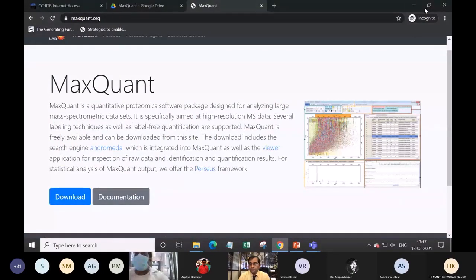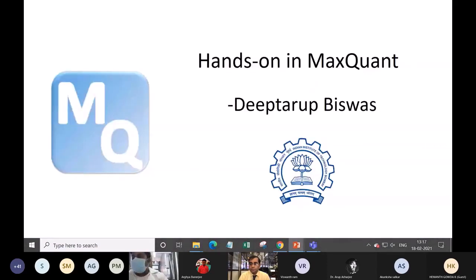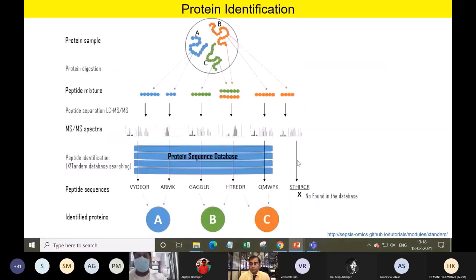And meanwhile, I will try to give you some basics, which Professor Sanjeeva has already given during the MaxQuant session. In MaxQuant, the things are pretty simple, as we have discussed. But how things actually move when we are talking about complex samples, where multiple samples are there, and how these particular algorithms actually work. So it's a pretty simple workflow that I'm showing right now.